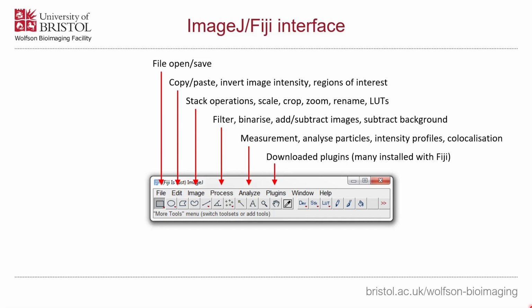If you have extended ImageJ or Fiji in any way, you'll find a lot of that functionality in the plugins menu. If you've got ImageJ, that menu is going to look pretty sparse, but if you've gone with Fiji, you'll find many subcategories there, such as tracking, segmentation.